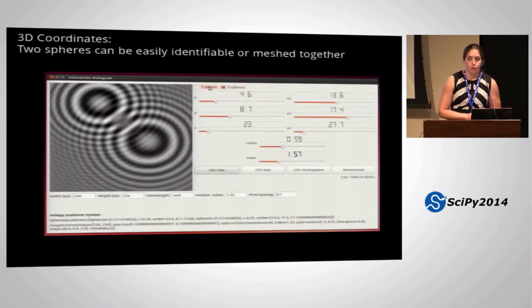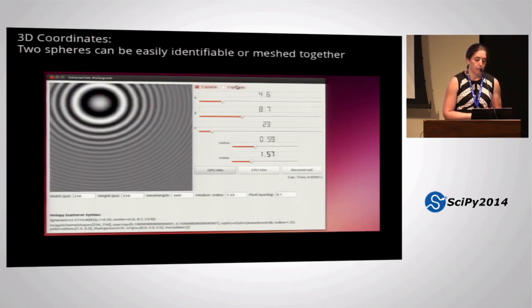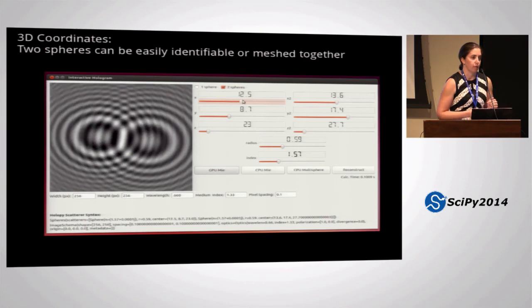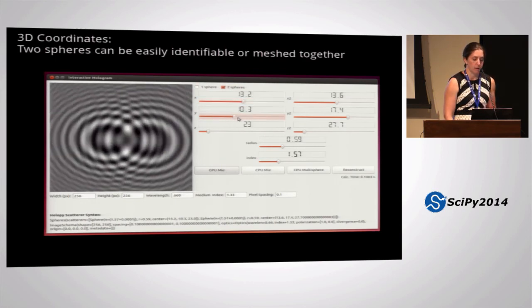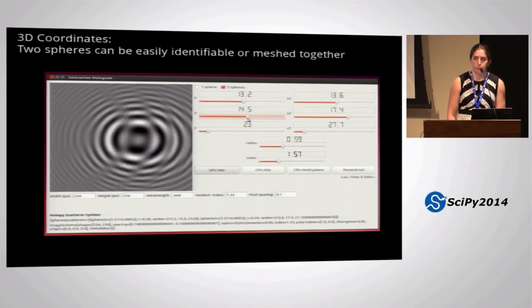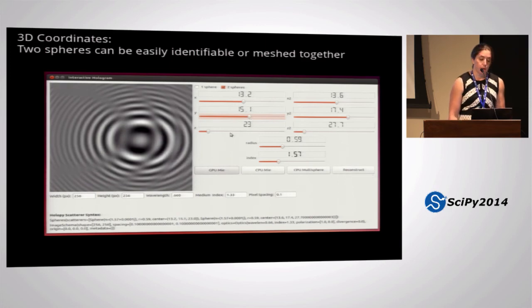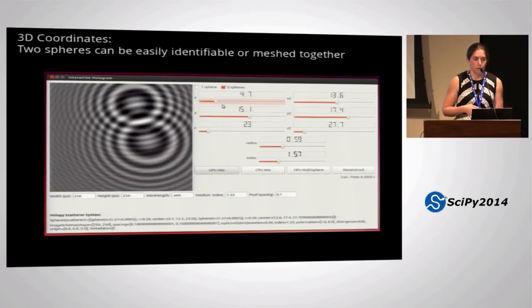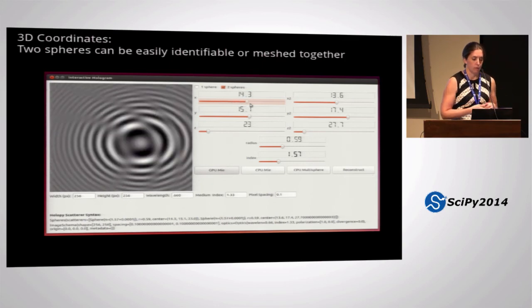And then things get much more interesting when you add in another particle. Initially, the particles are far apart, and you can see the two different ring patterns, so you could point to them and say that's where the x and y coordinates are. But as you pull them together, they actually emerge into one ring pattern with this additional linear fringe pattern cutting across it, which tells you about the relative orientation of the two spheres.